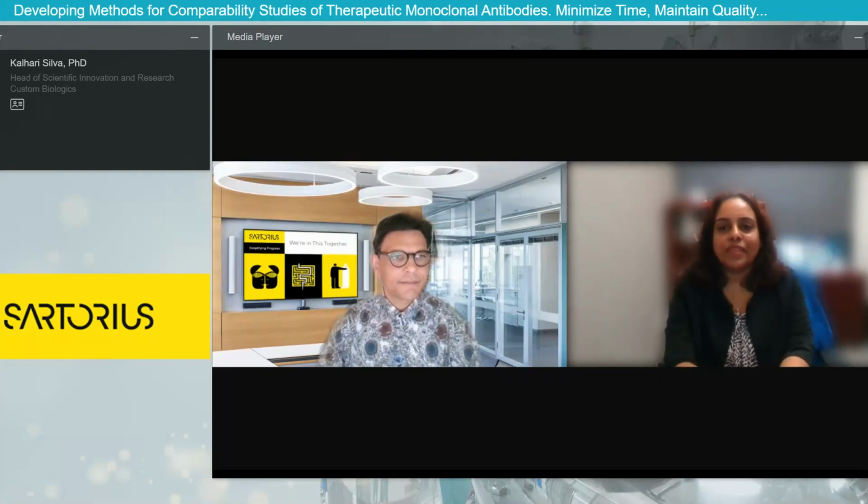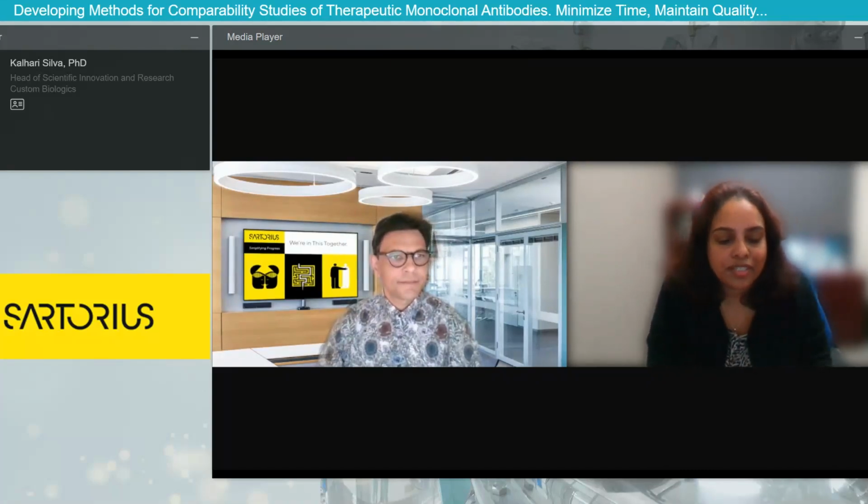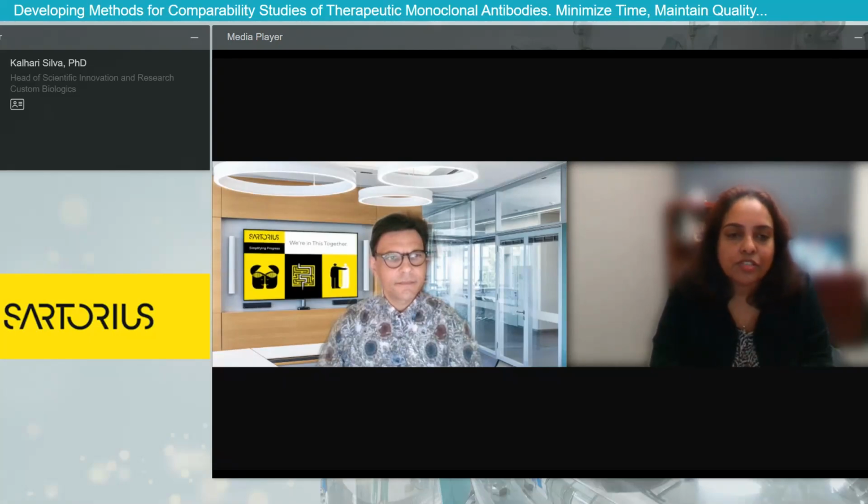Sure. Thank you for the question. I think it's a great question. And most of my talk was focused on non-specific binding. So the non-specific binding can occur as a result of many factors. It could be something in the media, it could be BSA, serum proteins, or any charged molecules that's in the assay buffer or in the sample.